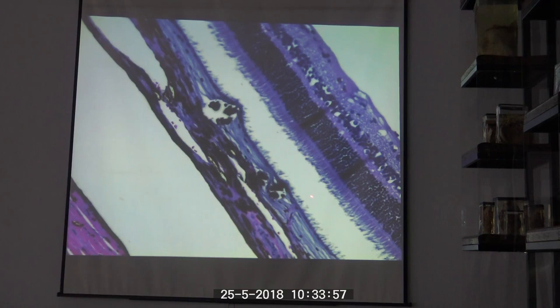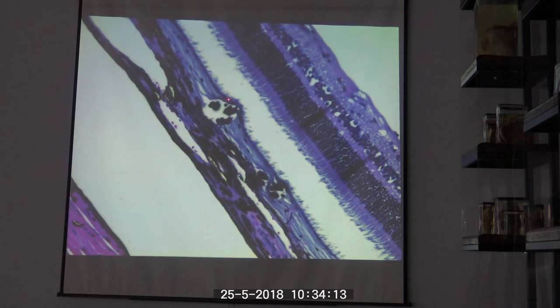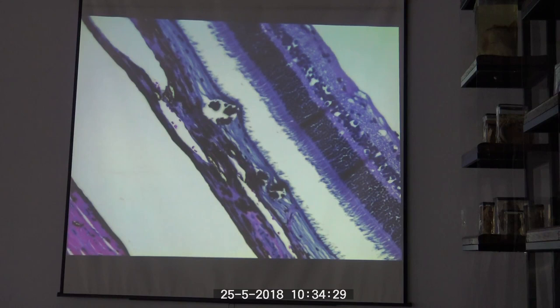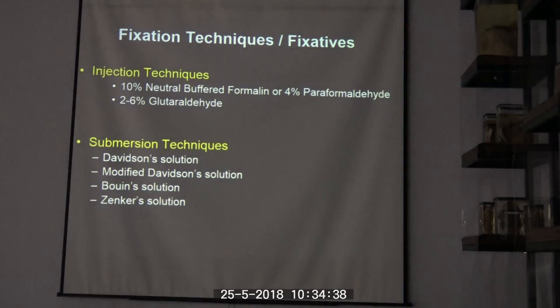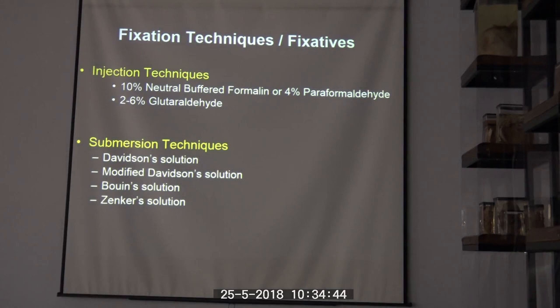Notice here the artifactual retinal detachment — the photoreceptors still show bits attached to the retinal pigment epithelium, which is classic for a post-collection retinal detachment. This afternoon I will show what to look for to confirm that a retinal detachment was a real in vivo change. Just be conscious, depending on the fixative used, to do what you can to reduce artifacts. In a diagnostic setting where formalin is the only option, be aware of what steps reduce artifacts.